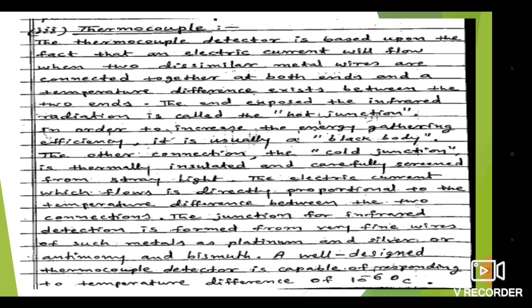The end exposed to the infrared radiation is called the hot junction, and in order to increase the energy gathering efficiency, it is usually a black body. The other connection, the cold junction, is thermally insulated and carefully screened from stray light. The electric current that flows is directly proportional to the temperature difference between the two connections.